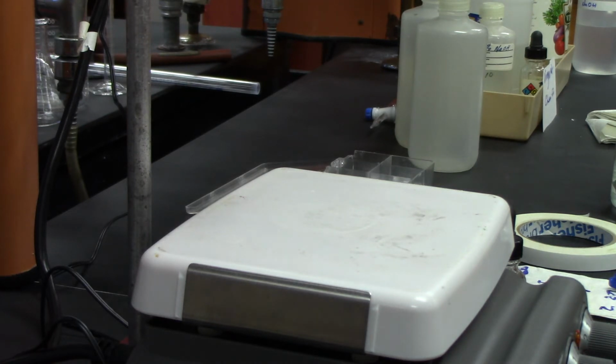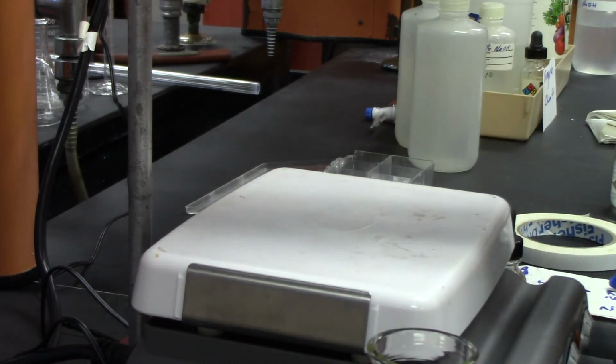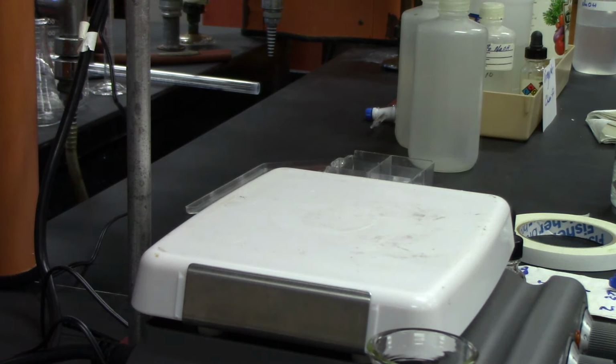Okay, next one is the second sample. Fill up the burette with sodium hydroxide. So if you think about what we just did, we added about 50, and then we had to add about 20 more, so we added a total of about 70. So we're going to have to do the same here. Hopefully it's going to be about 70 mils, so I'm going to have to double fill again.